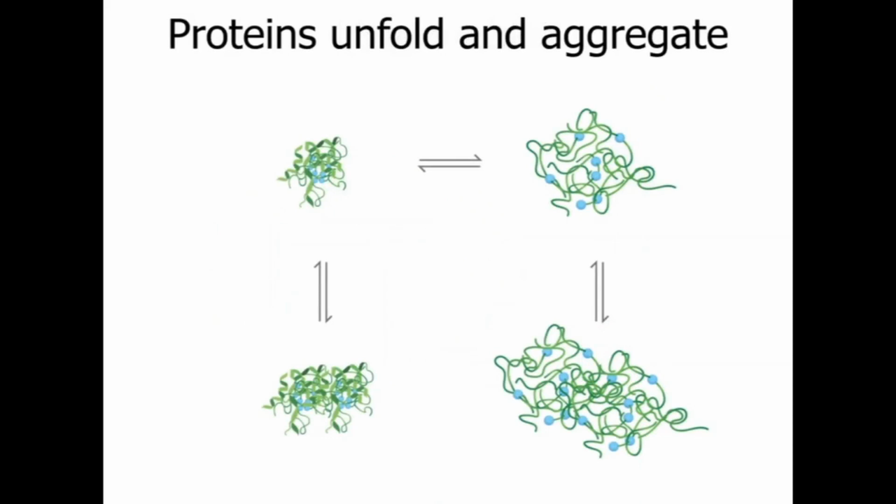For ADCs, as for all other proteins, there are 2 phenomena we need to look out for when we talk about stability. There is, of course, an equilibrium between the natively folded state and the unfolded state of the protein. We call this the conformational stability. In a thermal ramp, adding more heat energy will make the protein unfold.